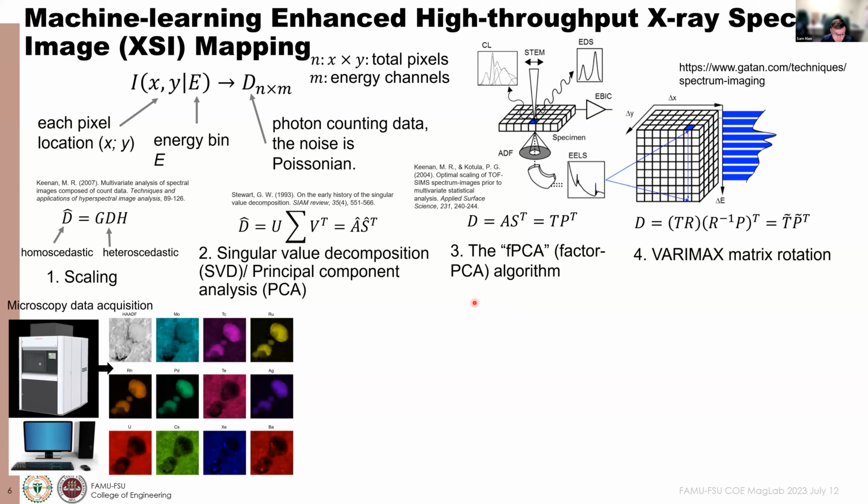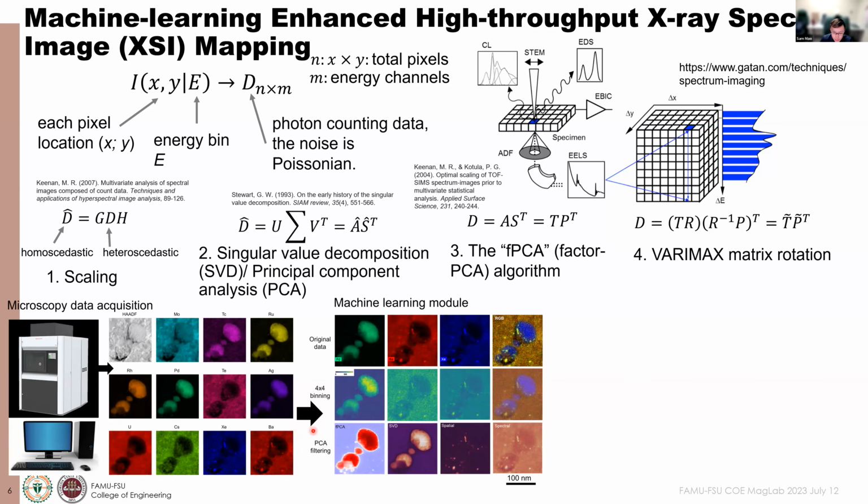So in reality, in our coding, this is a Thermo Fisher Talos microscope. You can obtain the original data from all these different types of transition metal precipitates, and then you can either do live processing or download it using Bruker, or whichever software or vendor you have.